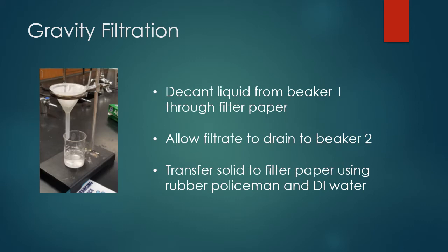Now for the gravity filtration. We're decanting the liquid from beaker one through the filter paper. By decanting, that means you're trying to pour off just the liquid and not get any solid. The reason for this is so that you're not clogging the filter paper, because if you put the solid in there first, it's going to get clogged and the gravity filtration is going to take much longer.